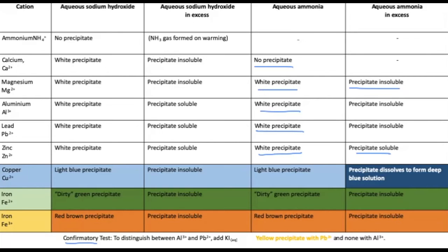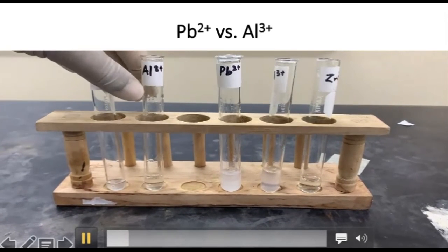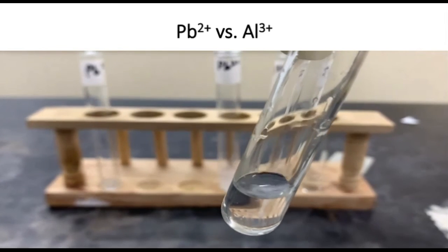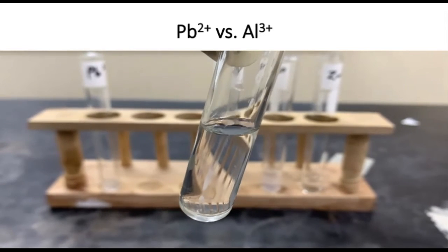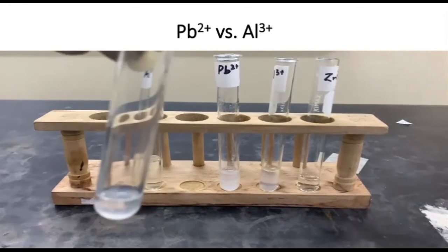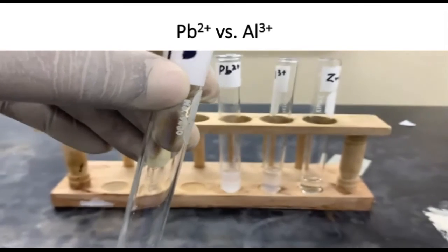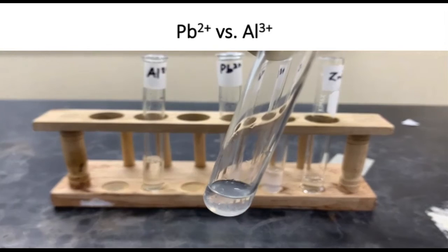We're trying to distinguish between aluminum and lead, seeing that both of them give us a white precipitate. So we're going to start with fresh samples of our aluminum, and we're going to add a small amount of potassium iodide. Now we've added more than a small amount and we don't see anything happening. So we put that back in the testing rack, and we're going to take our lead 2+ ions and add a small amount of potassium iodide.